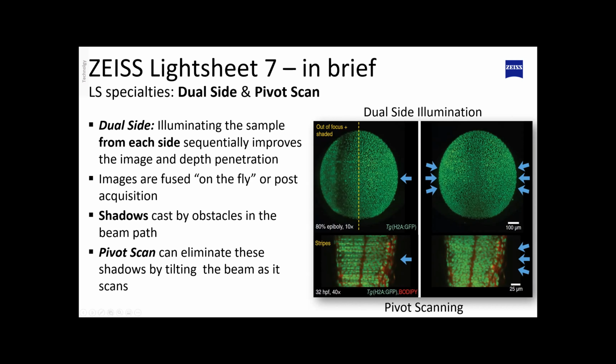The next thing to deal with for thicker specimens and light sheet illumination is anything that's in the light path of the forming light sheet being brought into the specimen. Anything that absorbs or blocks light will show shadows, and you can see these shadows represent stripe artifacts.